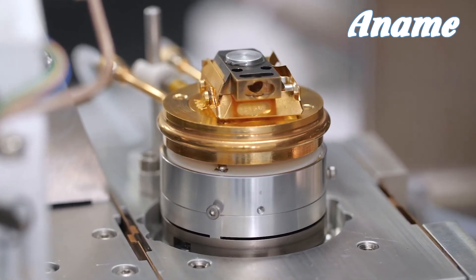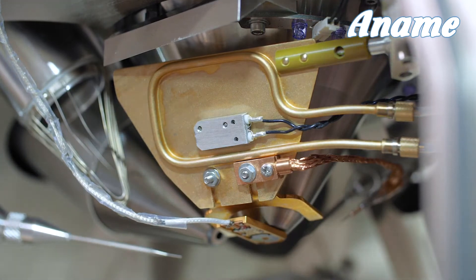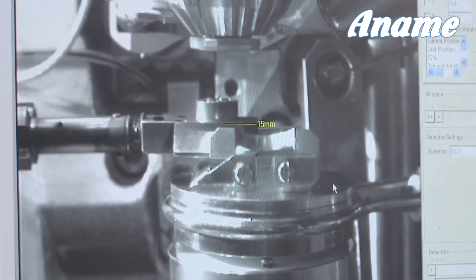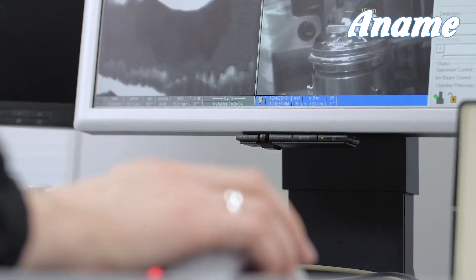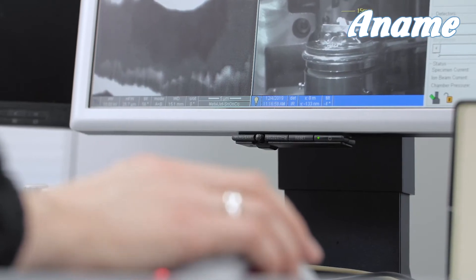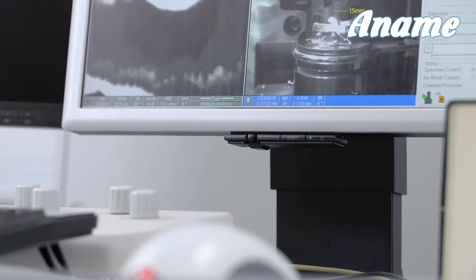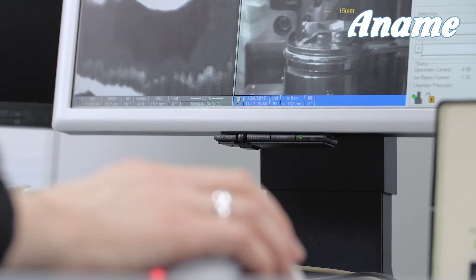For cryo-FIB applications, we are in the process of developing a new cryorotate stage. This allows temperatures of minus 180 degrees C at the sample to be achieved, and gives continuous 360-degree bidirectional rotation. This is very useful when thinning lamella, because once you have cut the first side, in normal operation you're cutting blind to cut the other side. If you can rotate the sample by 180 degrees, you can then see the other side of the sample and make sure it hasn't got any curtaining or other artifacts.